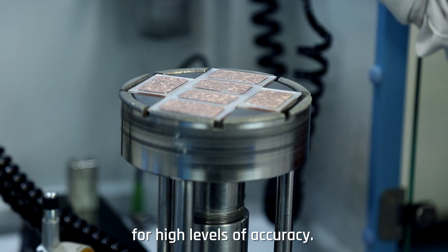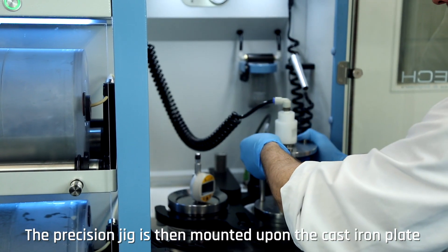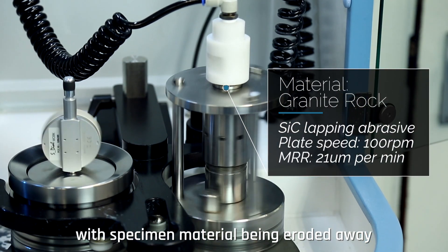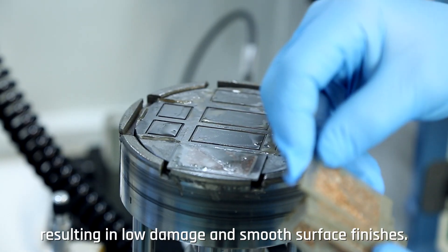The precision jig is then mounted upon the cast iron plate for machine lapping, with specimen material being eroded away resulting in low damage and smooth surface finishes.